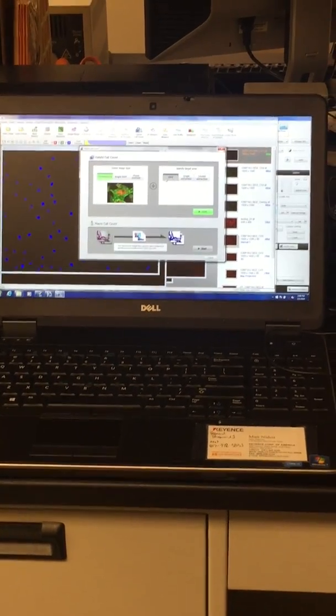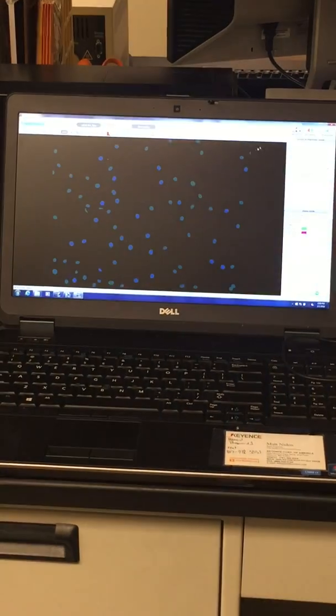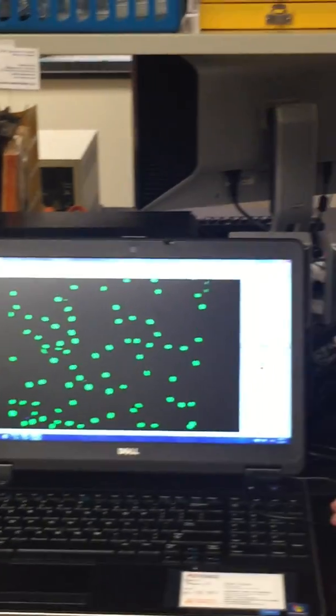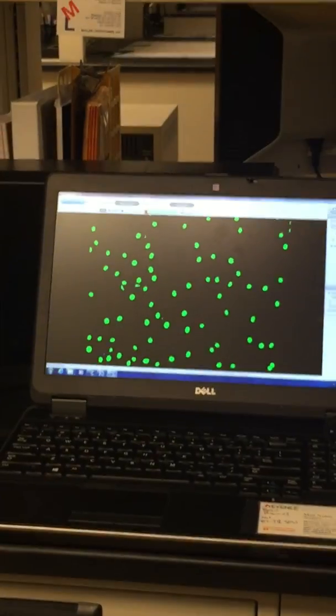And then you can just leave the extraction off, and then go to start. Basically, your workflow is up here: you create your mask, you specify your extraction area, you make any adjustments that you need to, and then you have your results.